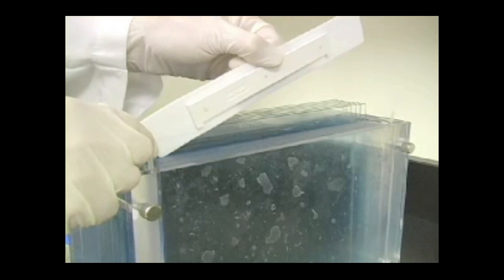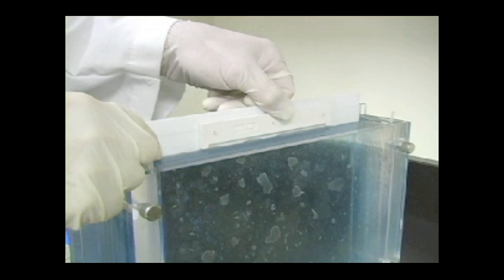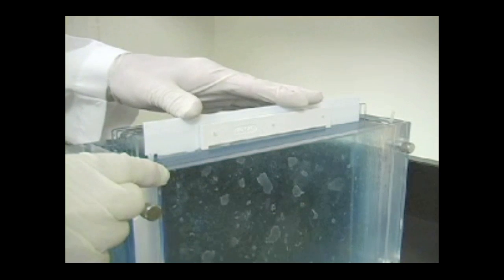Alternatively, insert a Protean Plus 2D comb into each hinged spacer plate. To minimize bubble formation, insert the comb at an angle.